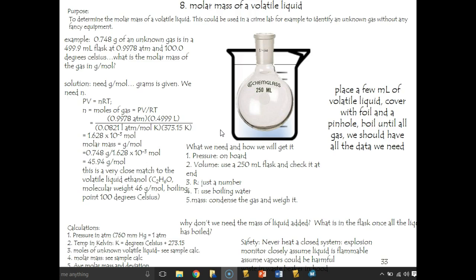Never seen it happen. In this lab, they use liquids where it's unlikely to happen, but even so, you must keep the goggles on at all times. You must stay alert, because in this lab we have both the risk of a flash flame and the risk of an explosion. So please be on your toes for this lab. Please keep the goofing around to an absolute zero.